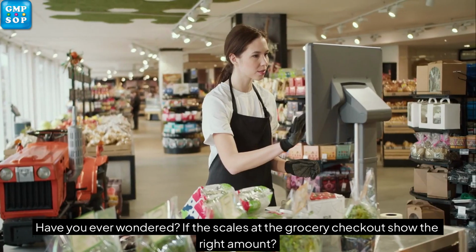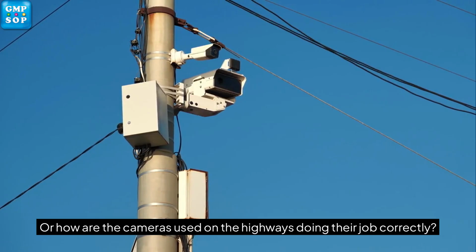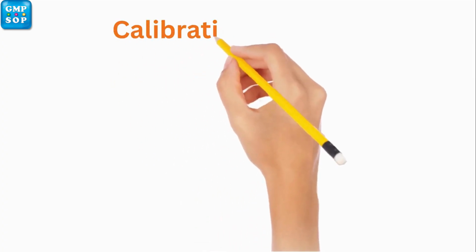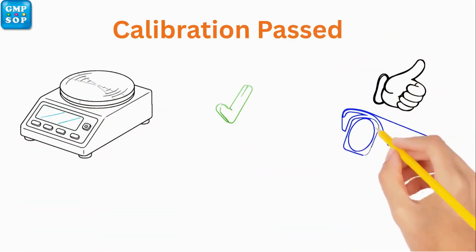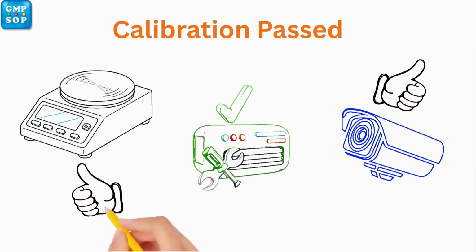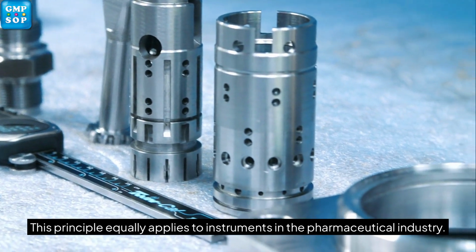Have you ever wondered if the scales at the grocery checkout show the right amount? Or how the cameras used on the highways are doing their job correctly? The answer is instrument calibration. If the scales at the shops and the road safety cameras are calibrated regularly, and those calibrations are passed, you can rest assured that those instruments are working fine. This principle equally applies to instruments in the pharmaceutical industry.